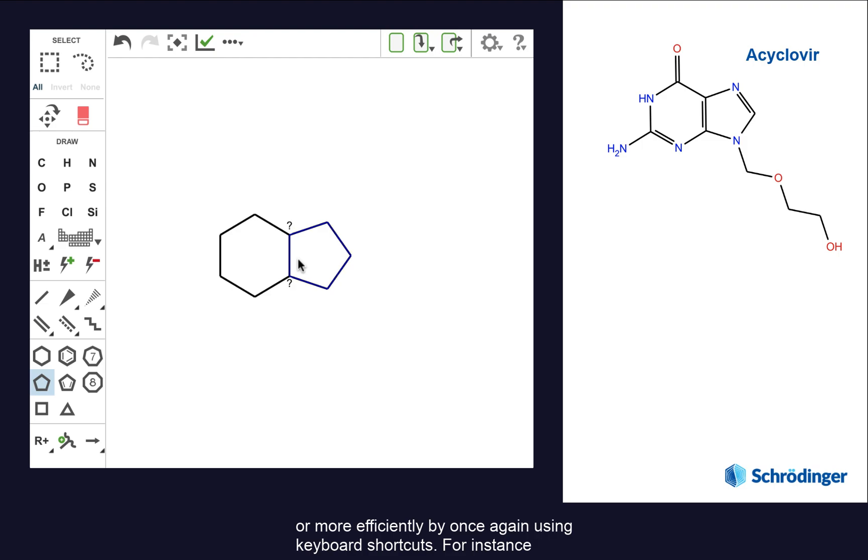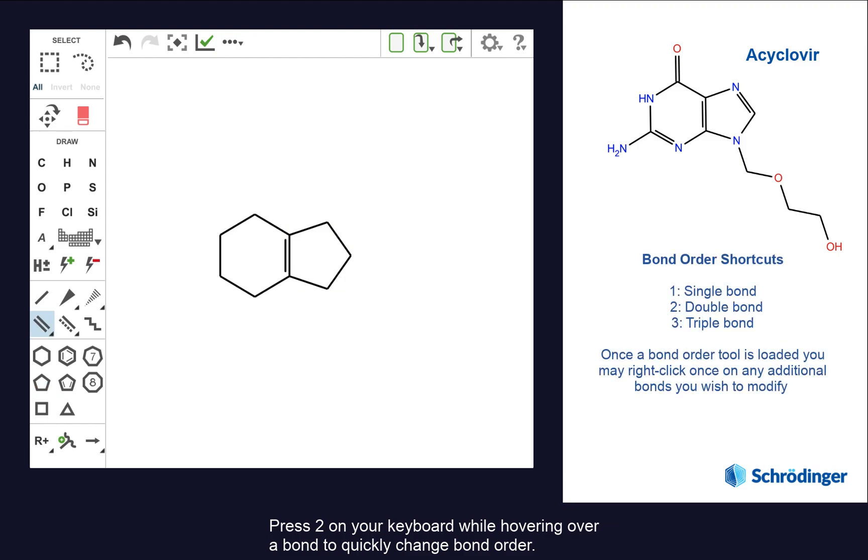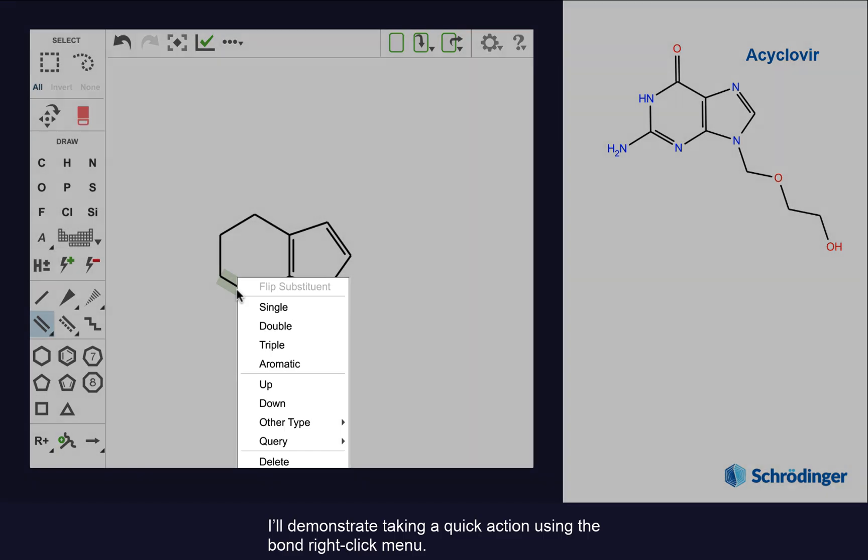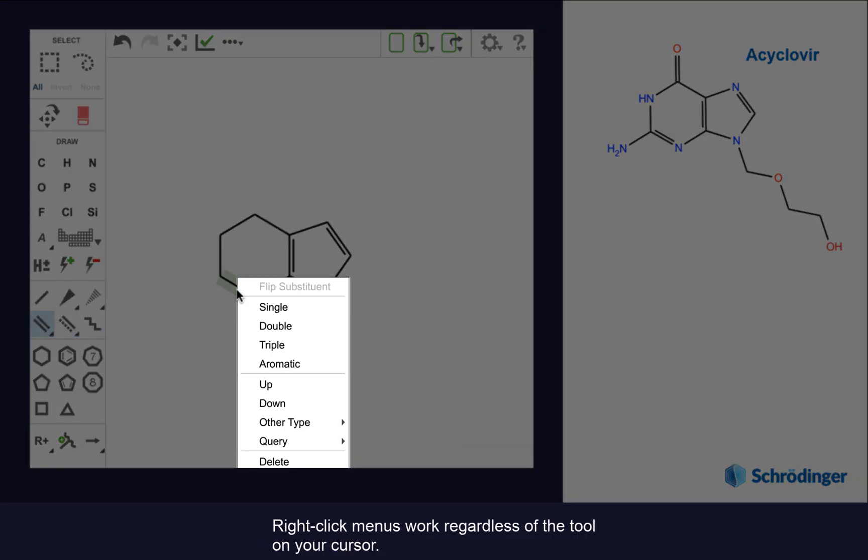For instance, press 2 on your keyboard when hovering over a bond to quickly change bond order. This also works for 1 or 3. For this last double bond, I'll demonstrate taking a quick action using the bond right-click menu. Right-click menus work regardless of the tool on your cursor.